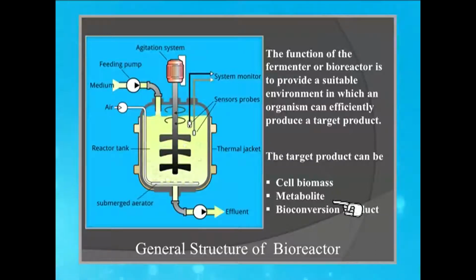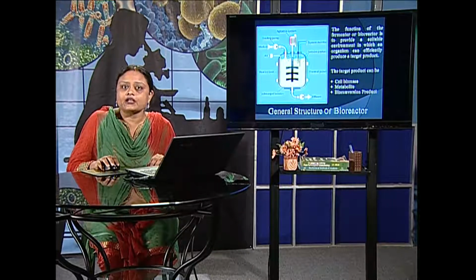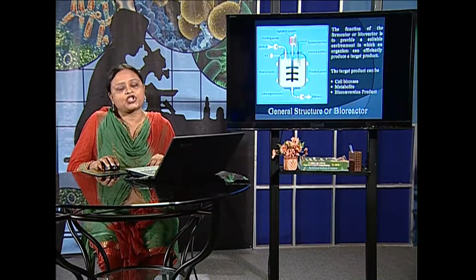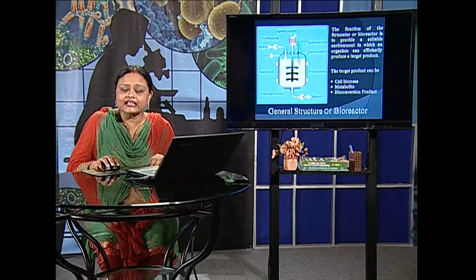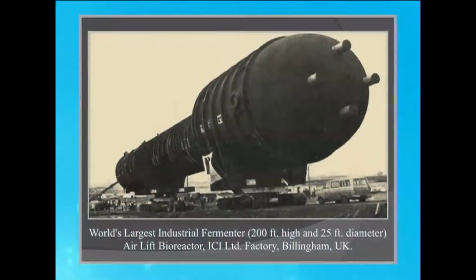And it can also be some bioconversion product, meaning just a one step reaction where an incorporation of microbe is required so that a substrate can be converted to a product in a single reaction by some microbial enzyme. This is the world's largest industrial fermenter. It is an airlift fermenter and it is still existing. You can see the dimension here, 200 feet high and 25 feet in diameter.